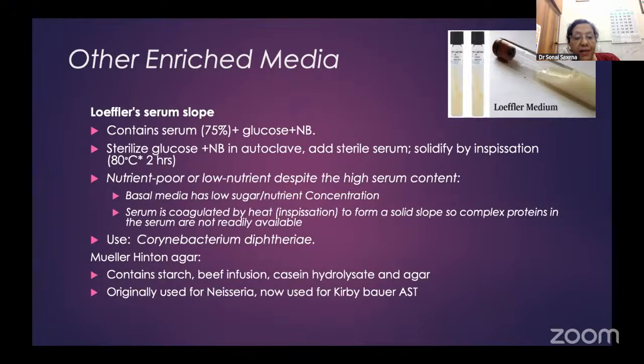So it primarily contains starch, beef infusion, casein and agar. The nutrition is provided by casein, solidification by agar, and beef infusion also provides nutrition. Starch absorbs toxic fatty acids and also provides complex carbohydrates for bacteria to grow.